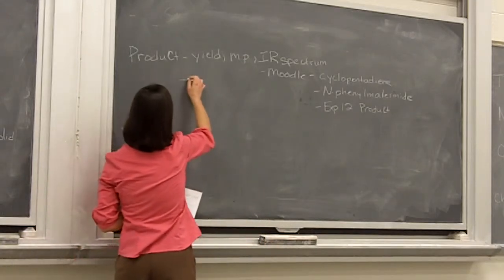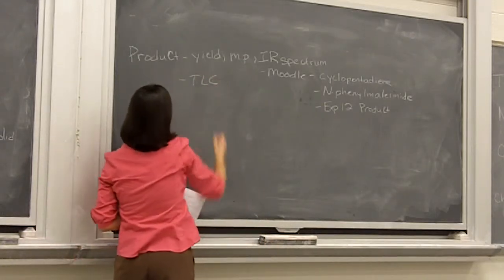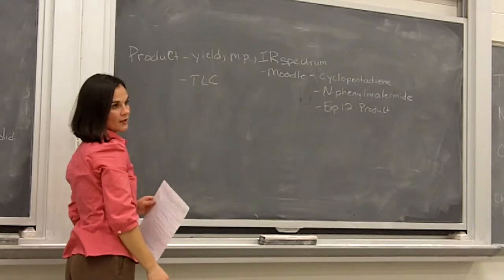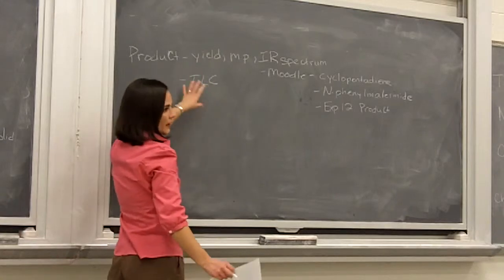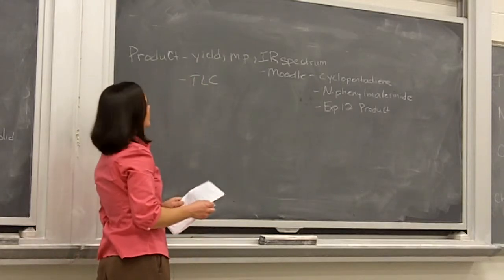The other thing that you are going to do is you're going to use your product for TLC, and I'm going to talk about how you're going to do that in a minute. So these are the 4 things that you need to collect of your final product.